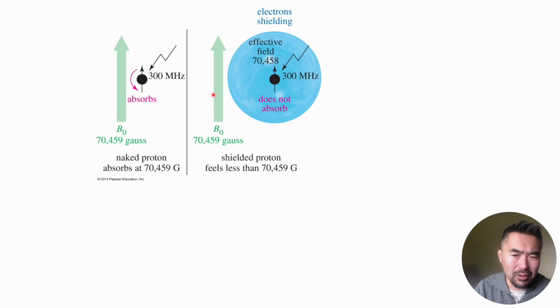And again, going over the same thing again, but with a hypothetical number. If you have what's called a 300 megahertz NMR, that's pretty high end. Well, the low end of a high end NMR is about 300 megahertz. These days it could go as high as 1000 megahertz. That refers to how strong of a magnet you've got, and we'll talk about why that might be important later. But 300 megahertz is kind of an average instrument.